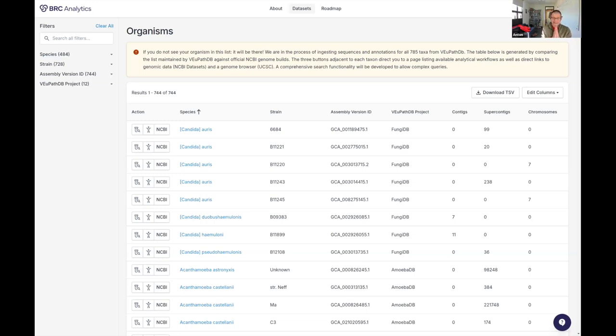So the model for today's webinar is the following. Suppose you're exploring some of the resources. In this case, I'm focusing on malaria because it's an organism for which it's easy to get data. Also, a lot of people I know here at Penn State work on malaria, so it's easy for me to get advice. But the general strategy that I'm going to show you today is applicable to any organism which we have there.